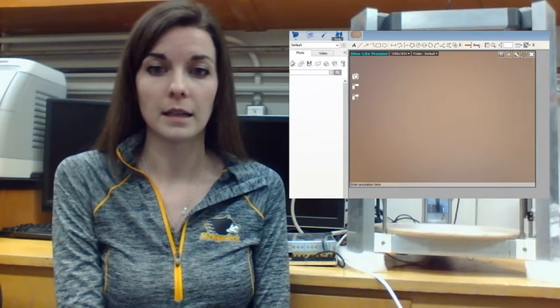By taking advantage of existing tools such as Raspberry Pi, Arduino controllers, 3D printed parts, and beam structure, advancements can be made toward creating a generic system of ultimately customizable automated microscopes. The 3D stage electronics in this particular setup shown behind me are comprised of a BeagleBone Black and a MELSI Arduino compatible board. The three stepper motors that create the movement of the 3D microscope are controlled by the MELSI, which is itself run by the BeagleBone Black. A computer is used to directly control the USB camera, and this computer is also connected via the network to the BeagleBone Black.